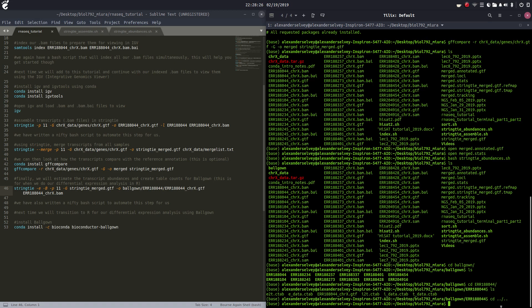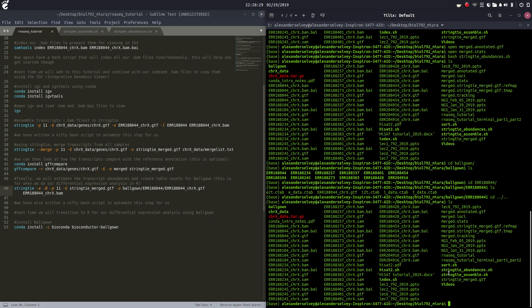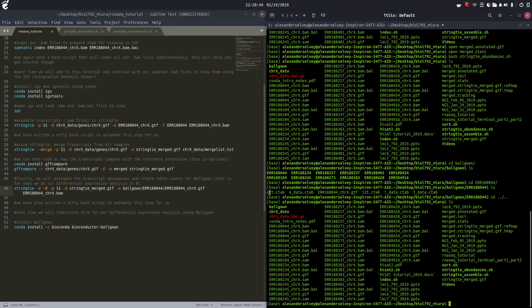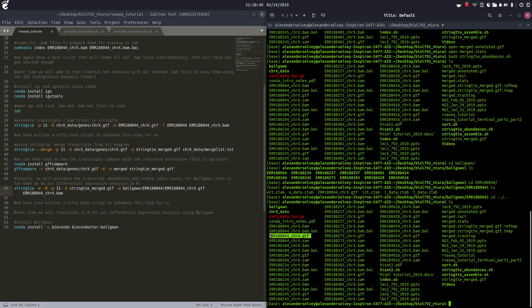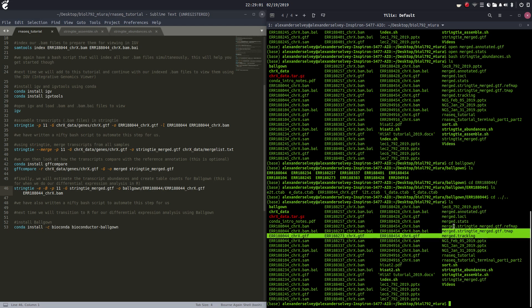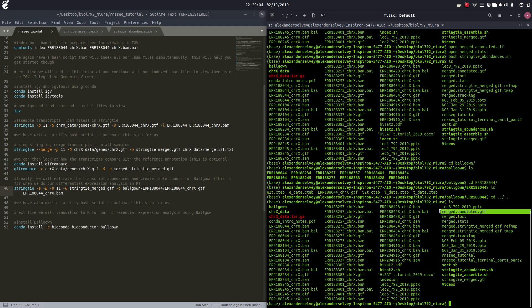Here's our ballgown directory with all of our samples created as directories, with all of the GTF files as well as the table files located inside the corresponding sample name directory. We've generated our GTF files, merged them, ran gffcompare, created some stats files, and created some annotated GTF files that we can refer back to.